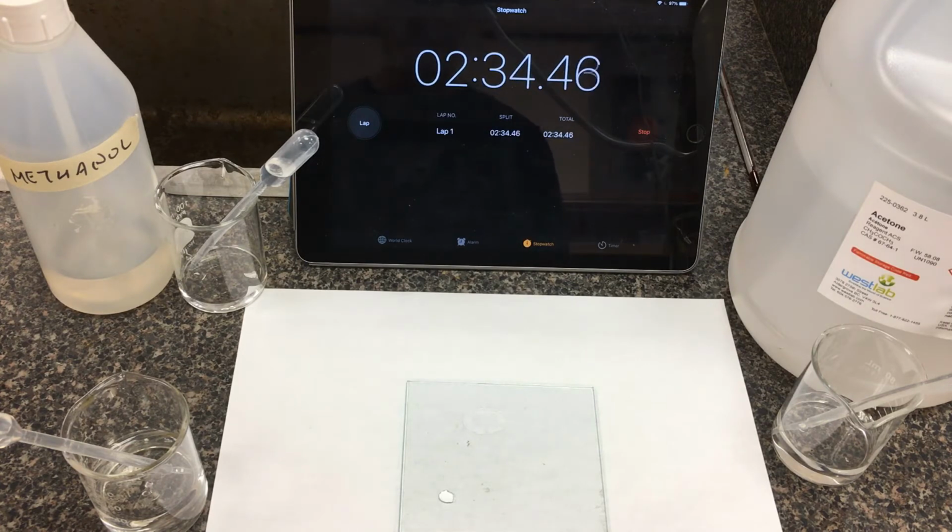You're starting to see some changes in the methanol puddle here. There's a little bit of a clear spot in the middle of the droplet. It looks like it's just about evaporated, although the water is pretty much holding its shape there.